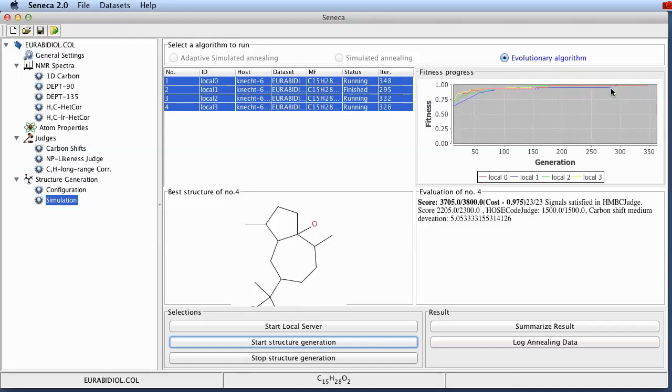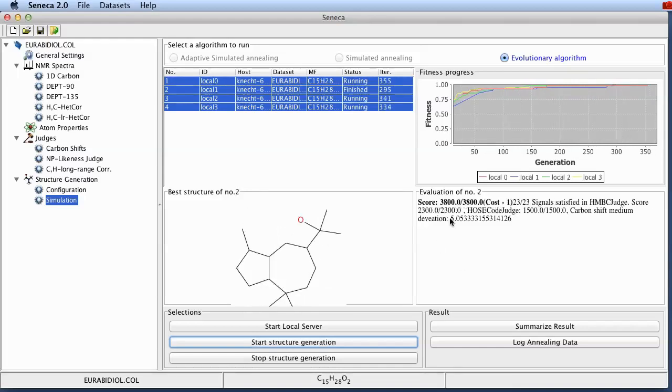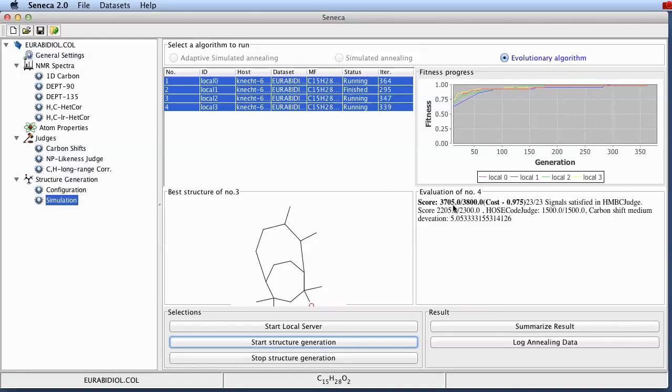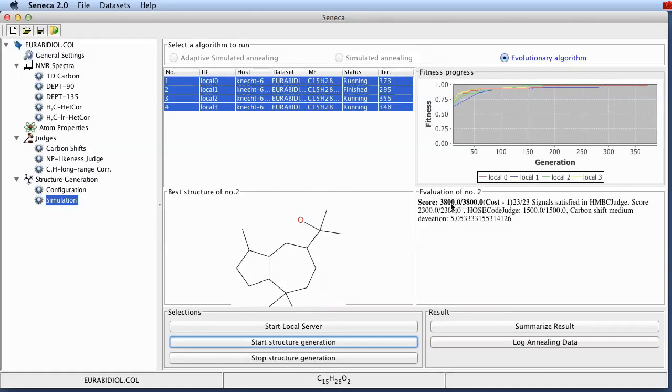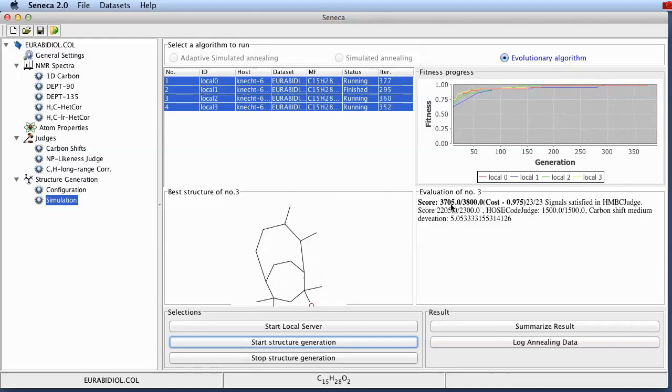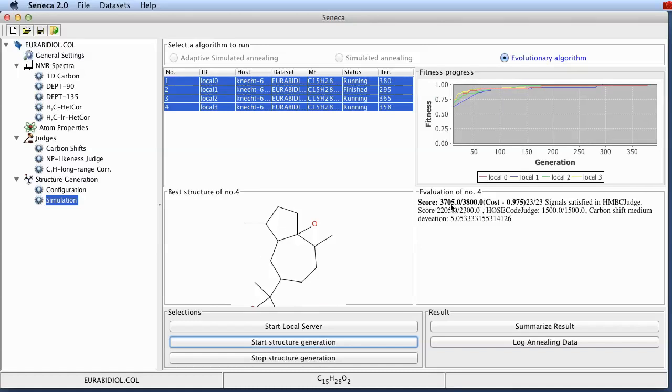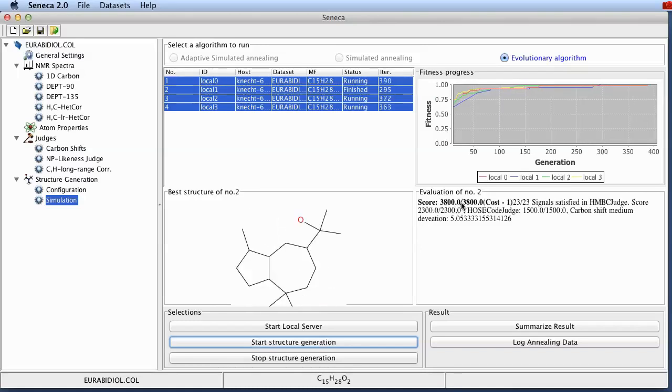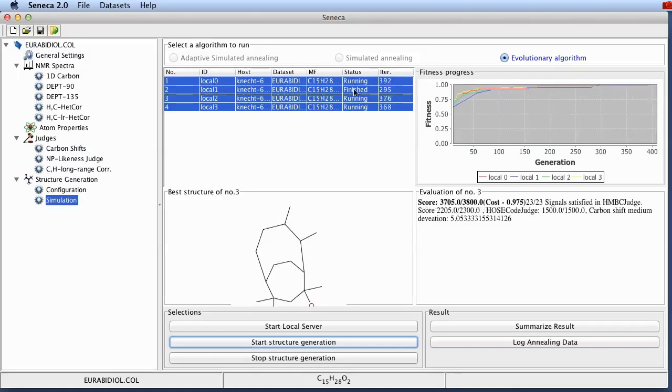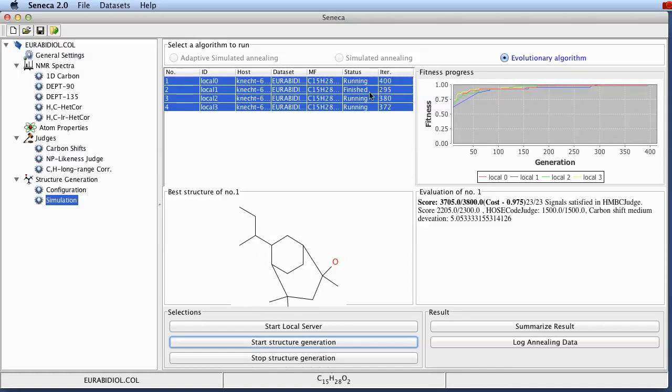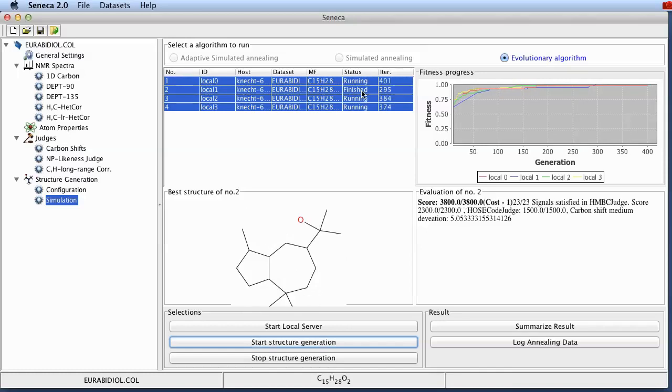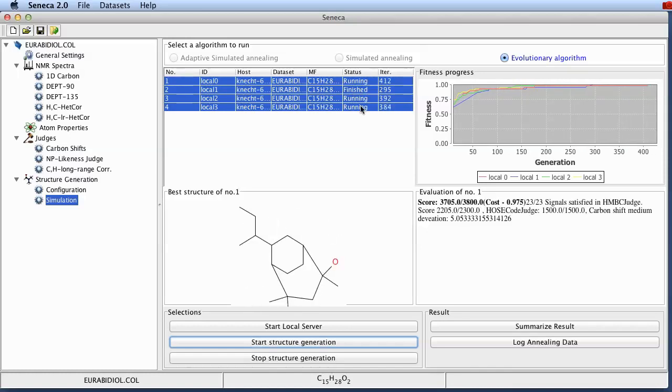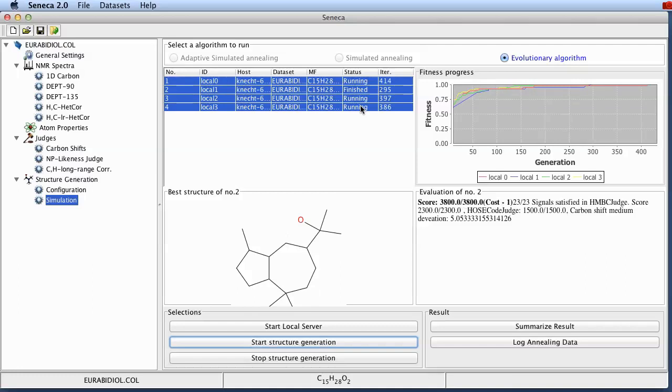And here we go. Server number two has found the correct solution with 3800 as a maximum score. And you can see here in the upper right corner the server has already finished its optimization. Whereas the other servers are still running.